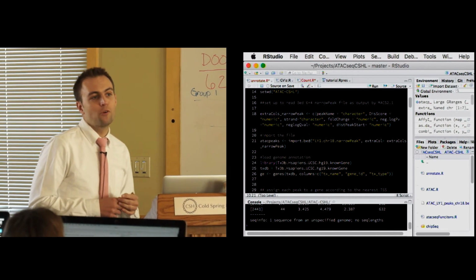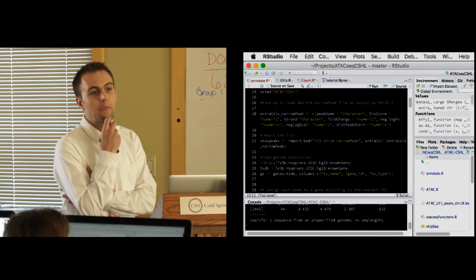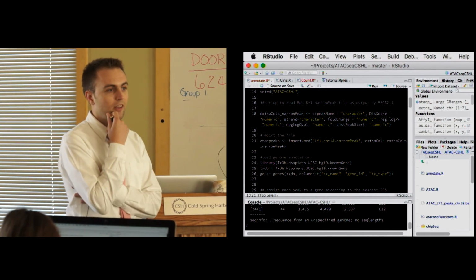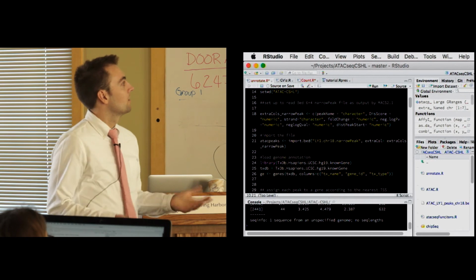So what can we do with the data now? Are there any questions we can ask from where we are? Yeah, right. That's probably the best way to start. I would say so.